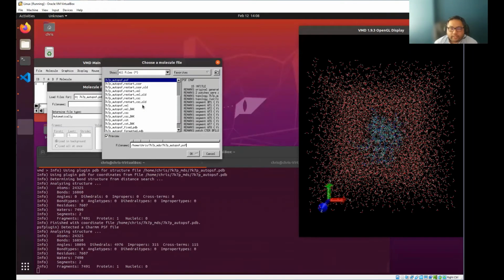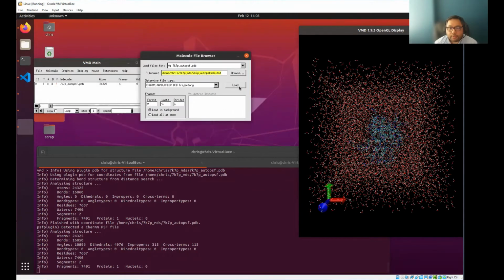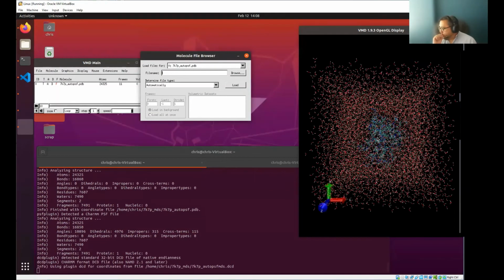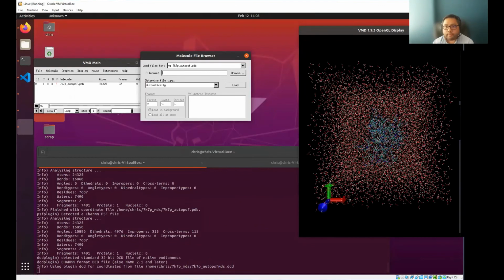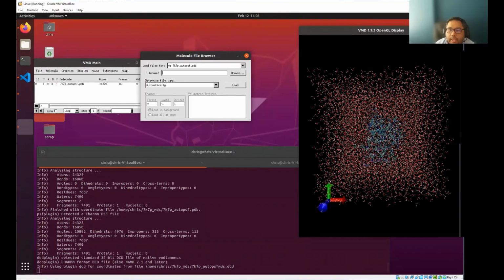And then after molecular dynamic simulations, it's going to shoot back another DCD file. This one, I actually relabeled this earlier. So this was my MDS file that we were going to work on. And so once we load that into it, we'll just let all those frames load in that we captured.